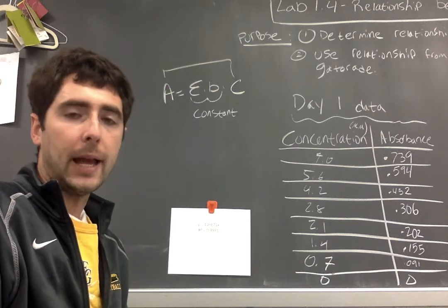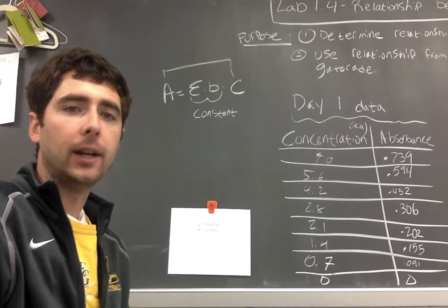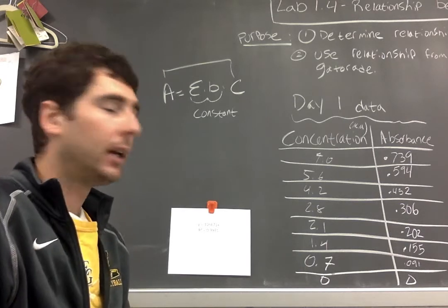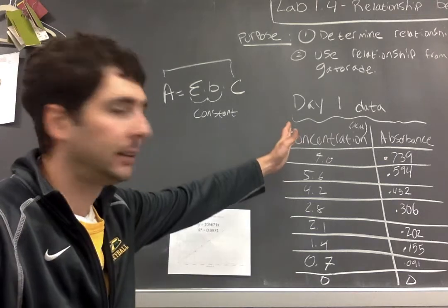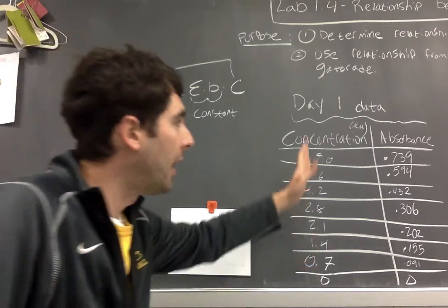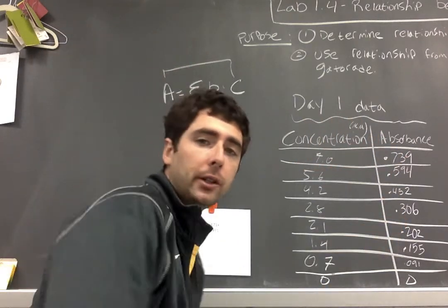Hi everyone, this is Lab 1.4, Day 1 Data Analysis. So in the first part of our experiment, we calculated various concentrations of a blue food dye solution and then measured the absorbance of all of those different concentrated solutions.